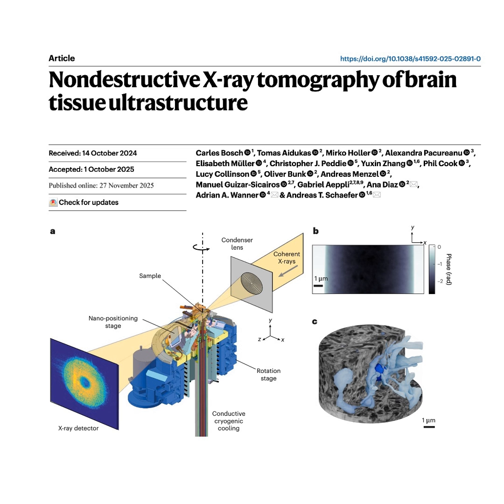Now, for those of us who aren't neurobiologists, what can you actually see at 38 nanometers in, say, the hippocampus of a mouse? Well, this resolution is more than high enough to see major features, axon bundles, dendrites, big organelles like mitochondria and myelin sheaths. Okay. But the critical breakthrough for connectomics, for that wiring map, is that 38 nanometers is good enough to reliably resolve synaptic contacts. So you can see the actual junctions. We can now visualize the actual communication points between neurons using this scalable X-ray technique.